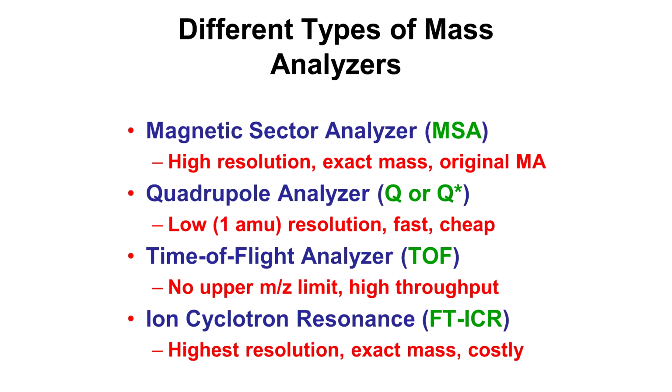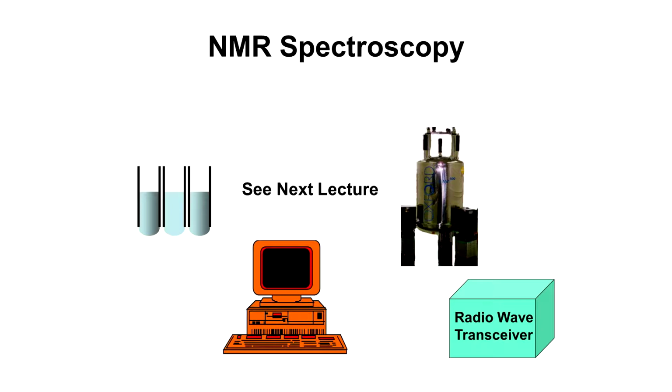And with those, you can get near exact mass, remarkable precision, and they're remarkably robust instruments as well. So that's a quick run-through of mass spectrometry. I think, obviously, we could spend weeks talking about it, but this is just a quick update to make you aware of what's possible. I'll talk more about NMR in terms of its use.